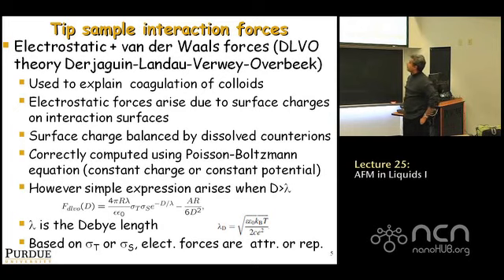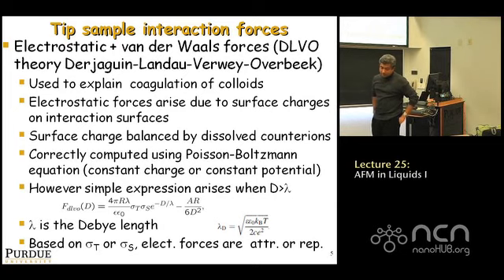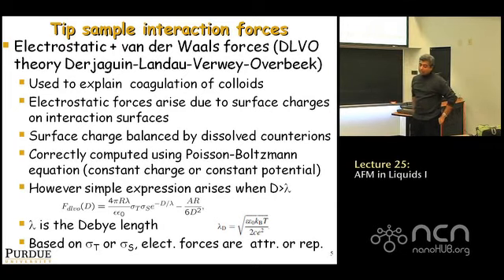But roughly what happens is when you have two solids in an ionic medium like water, two kinds of processes occur. Your material itself could be a semiconductor, or a metal, or an insulator. In any case, either you have some trapped charges on the surface, or you have a contact potential or a surface potential, whatever it is you're dealing with.